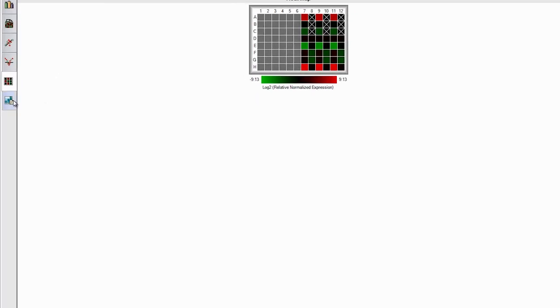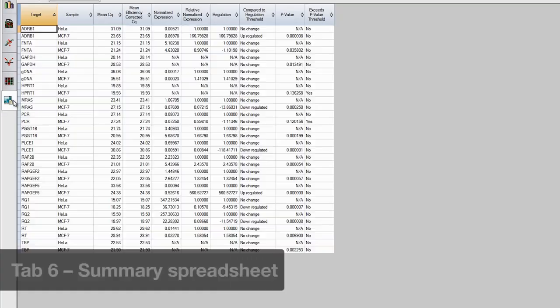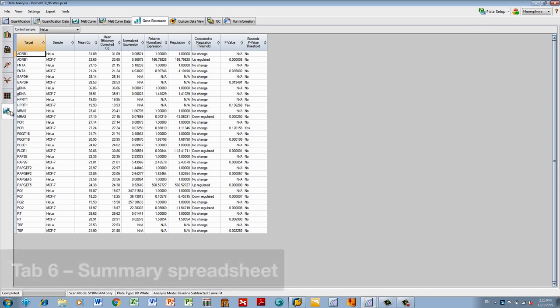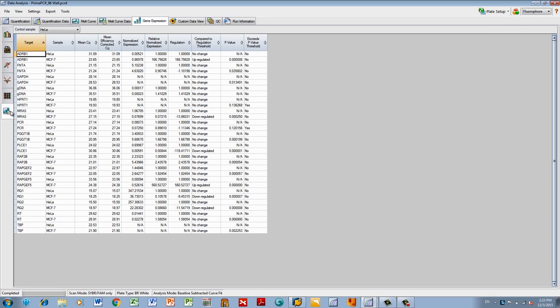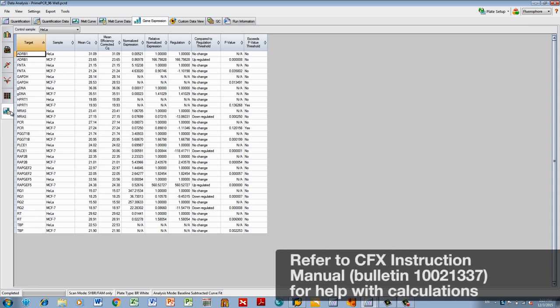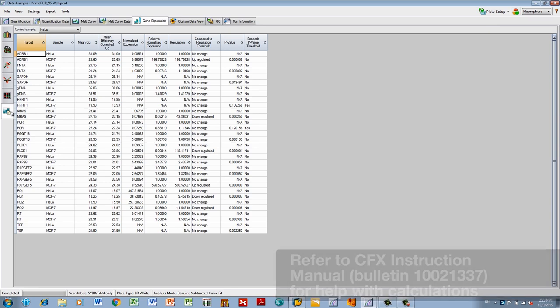The last tab is a summary spreadsheet with all the results indicated. For details on how to carry out the calculations, refer to the Gene Expression Calculations section in the CFX Instruction Manual, which can be downloaded by searching for Bulletin 100-21337 on Biorad.com.